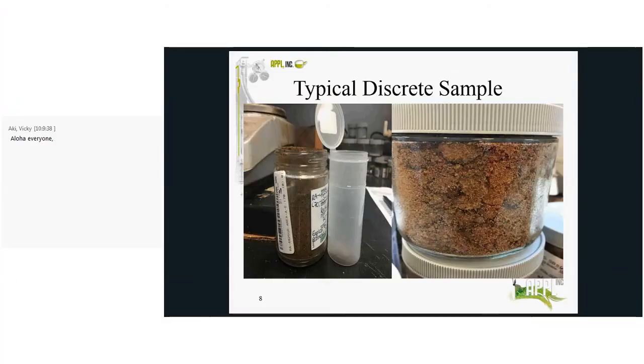One gram of this sample, grabbed from the top of the jar, is obviously not representative. Results from a laboratory duplicate taken in this fashion would likely not be reproducible. It would also be difficult to extrapolate back to the field and determine what the results represent.